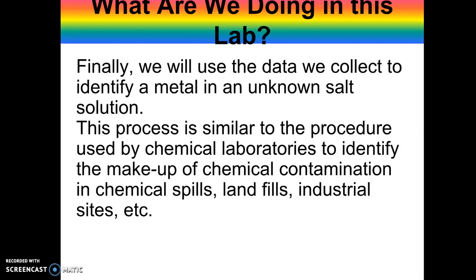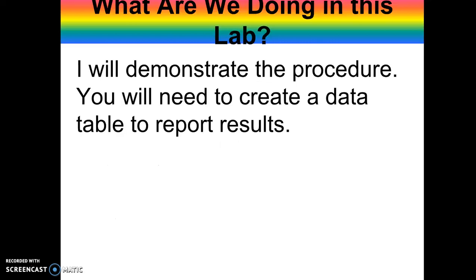This process is very similar to the procedure that chemical labs use to identify any kind of contamination or spill or landfill from industrial sites, etc. So this is very applicable to what is going on in the real world. I hope you enjoy this lab, and remember that this does involve a flame, so we need to remember our procedures for using a flame. I'm going to demonstrate that procedure again to you guys, and we've got data tables that we'll need to record results and figure out, again, who killed Pineapple Willie. So if you have any questions, please let me know.